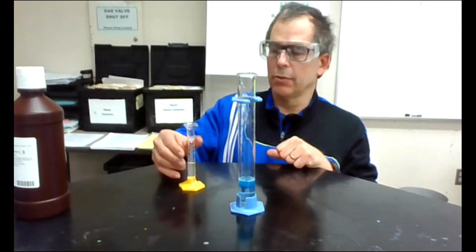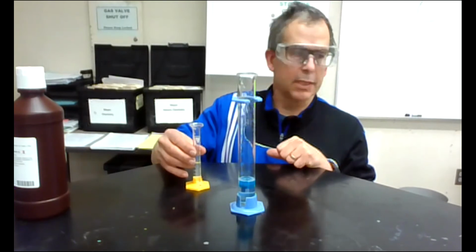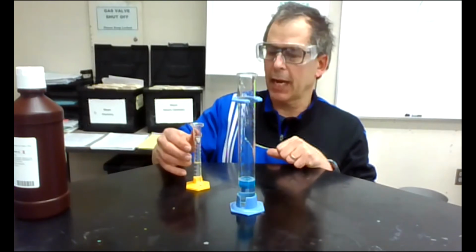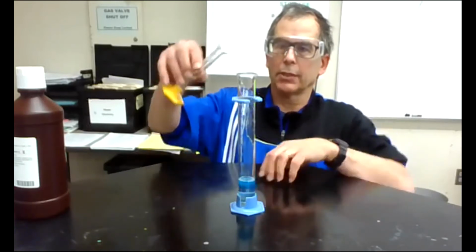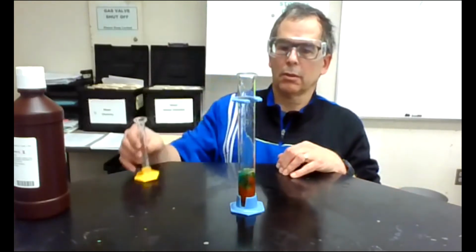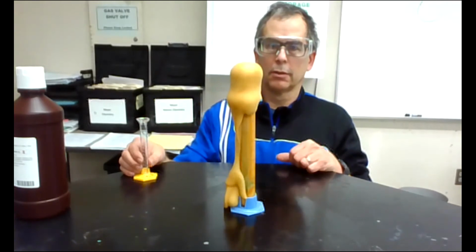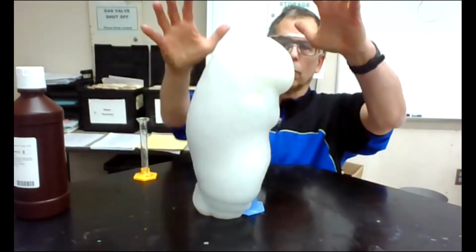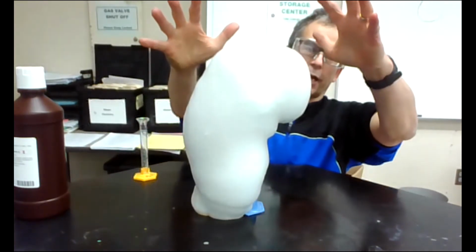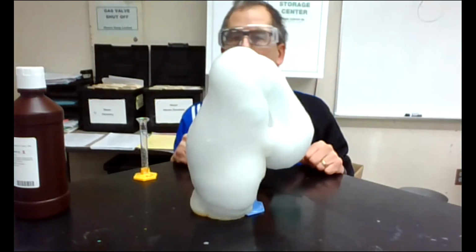Let's see if we can speed it up. What I'm going to do is speed this up by adding, this time, instead of potassium iodide, sodium iodide in a liquid form. Let's watch what happens. Ooh, look at the steam being generated. So that's really heating up really, really well.